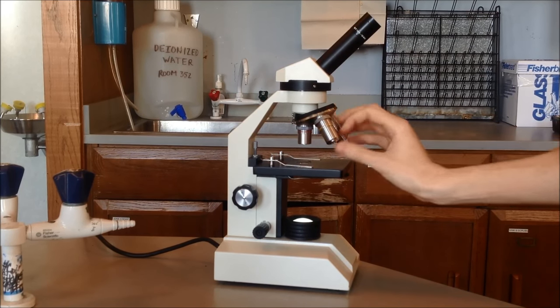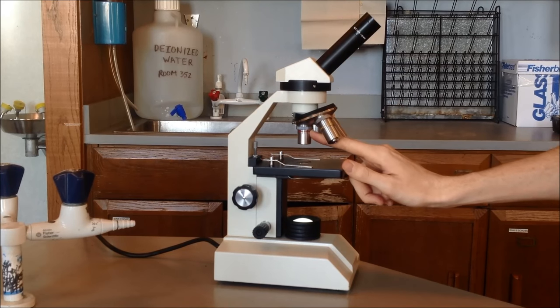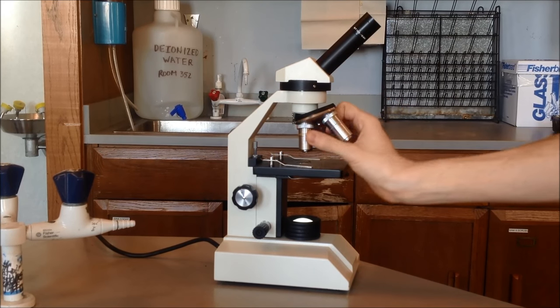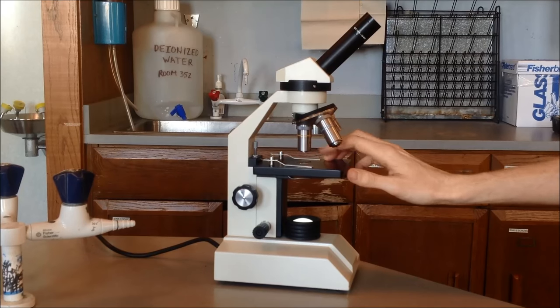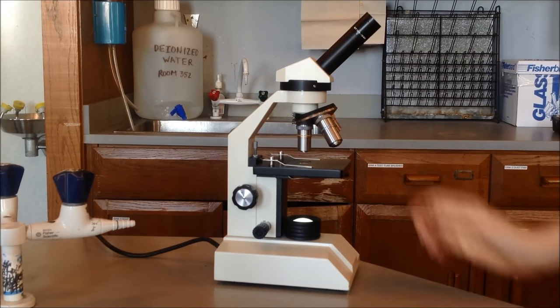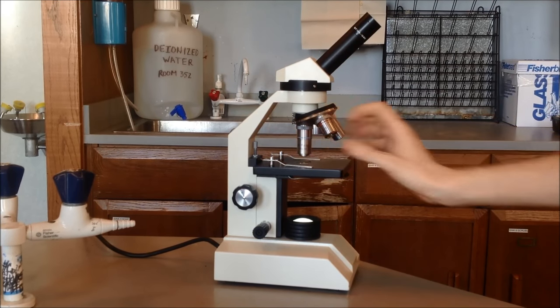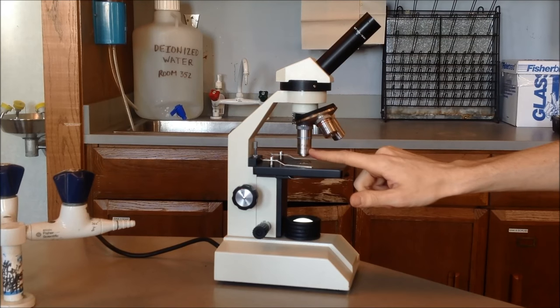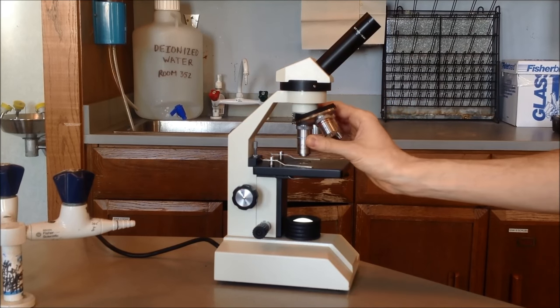The scanning, as we mentioned before, has a magnification of four times. The low power, or the yellow one, has a magnification of ten times. The high power, or the blue one, has a magnification of forty times.